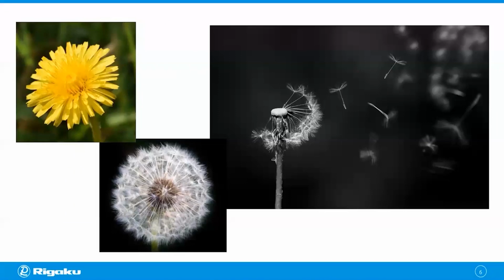So maybe we need to consider some extra hardware or steps to minimize movement caused by external effects like air movement. And secondly, it's very likely that you're not interested in a single image of the dandelion, but are instead interested in how the dandelion changes during its life cycle, or how it changes in response to some external stimuli. Plant researchers often want to understand how plant morphology changes, so in fact they may perform many experiments across a number of experimental variables. So the key is that one image is often not enough.